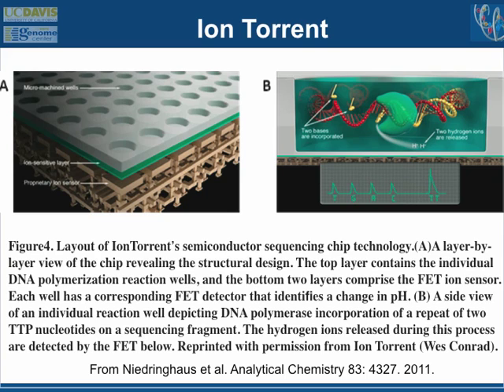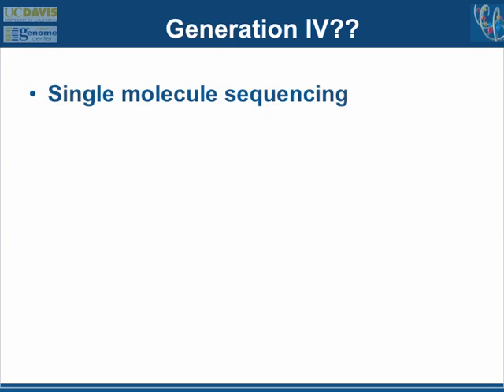And it can do the equivalent amount of sequencing in 15 minutes or so, as opposed to in a whole day. Now, it's not very accurate, and it's still a pain in the butt to feed this machine, but I know people who have these machines, and they're really quite cool, and if you are able to make libraries quickly, you can get data by the end of the day. I mean, it is really quite a remarkable thing. It's not very accurate right now, so you have to sort of use it in the context of what its error probability is. It has some of the same problems with homopolymer runs as 454 sequencing.